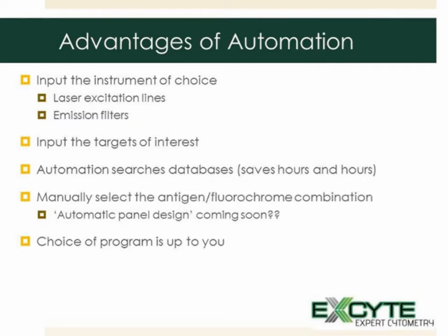Now, don't be concerned or frustrated if you choose a panel and you run it and there's issues. You sometimes have to go through in an iterative process and tweak out one or two of the fluorochrome antibody combinations.